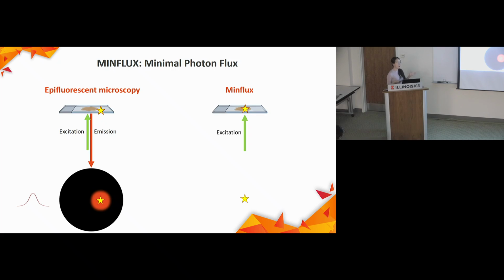We really don't know. Okay, so think about if the excitation laser is of a special shape. It's a donut-shaped laser. And if somehow you can move this donut-shaped laser to where the molecule is at and make the molecule localize at the center of the donut-shaped laser, then where the donut-shaped laser is at is where the molecule is at, right? But we can't do that.